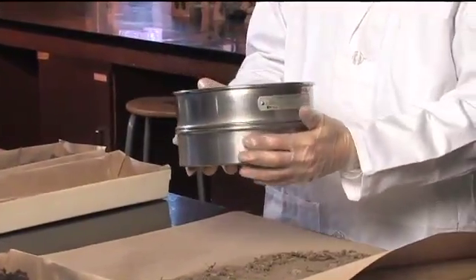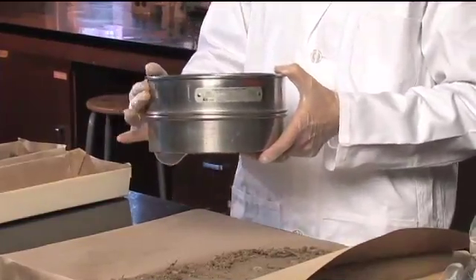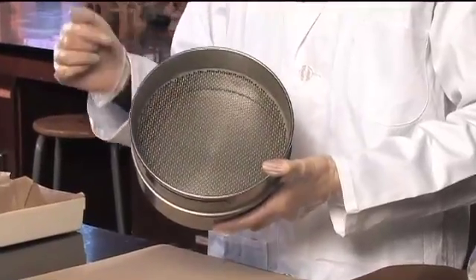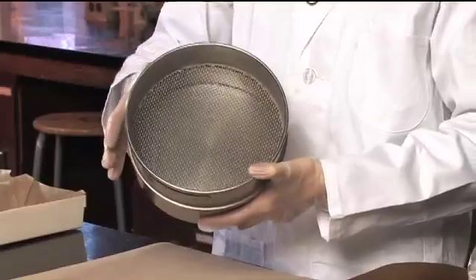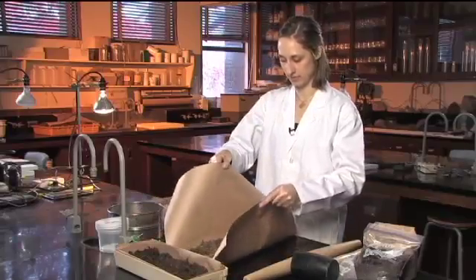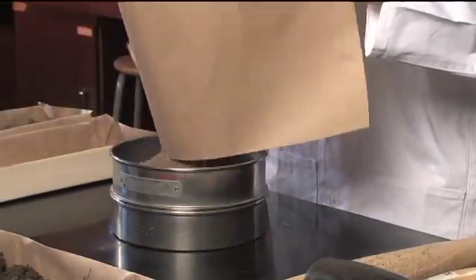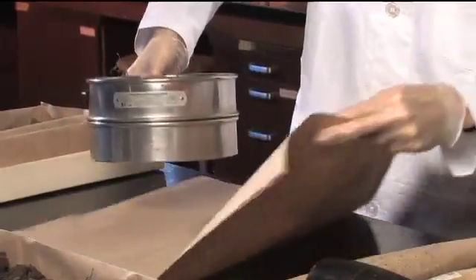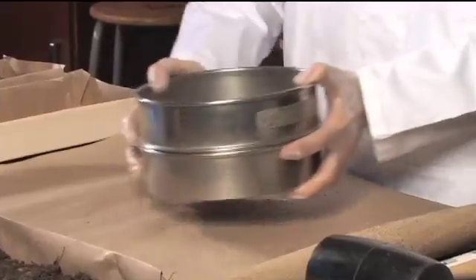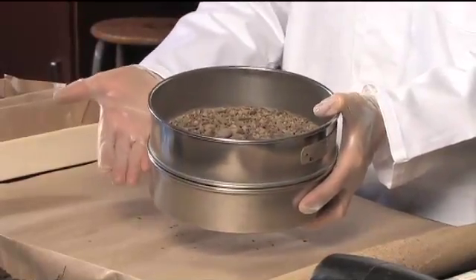The sieve has a bottom part to catch the sieved material, and you need to select the proper mesh size for the top. This is a two millimeter mesh, so each of the holes is exactly two millimeters. You want to treat these kindly and not poke them so that you don't change the size of the holes. After your sample is broken up, just put it into the top of the sieve and give it a shake.